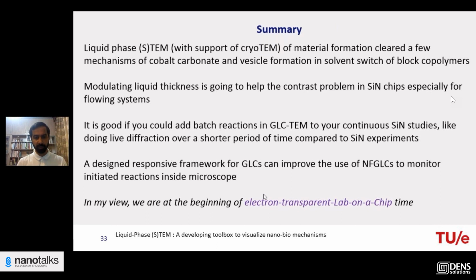You lose some of your resolution, but you make bigger particles to even encapsulate bacteria in big water pockets, or let's say oceans of water in that scale, nanoscale oceans.